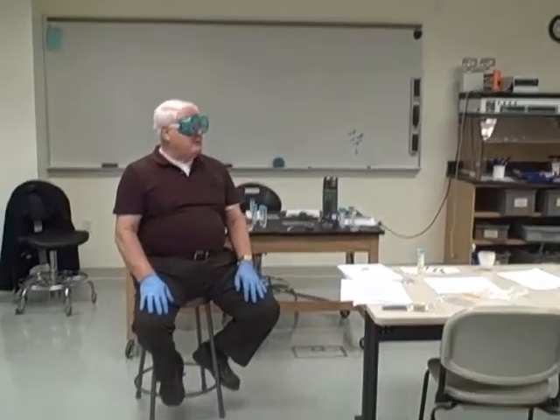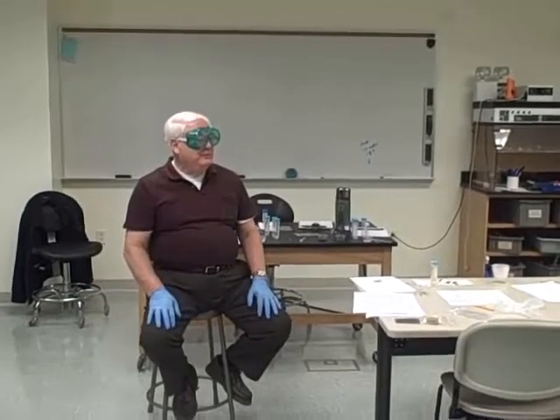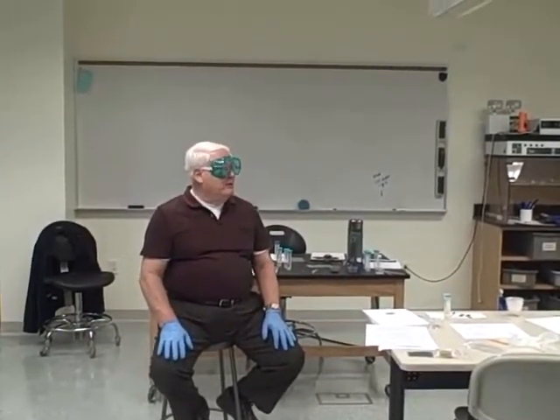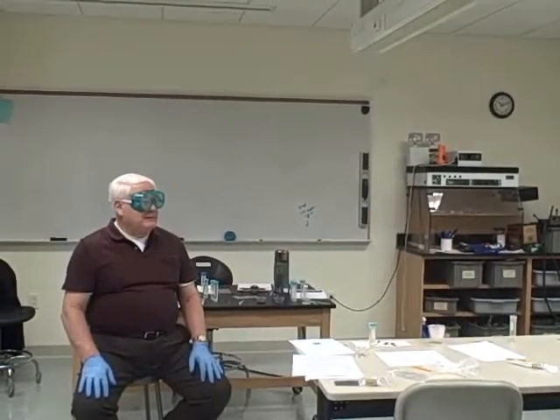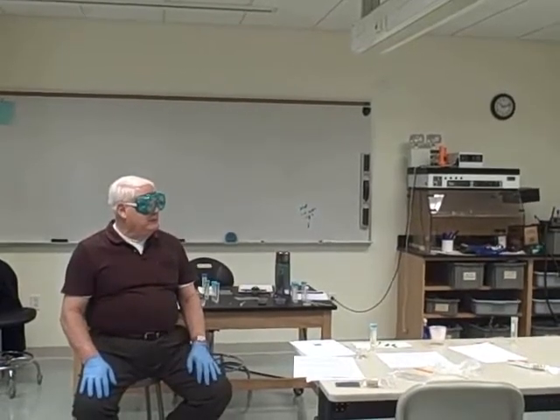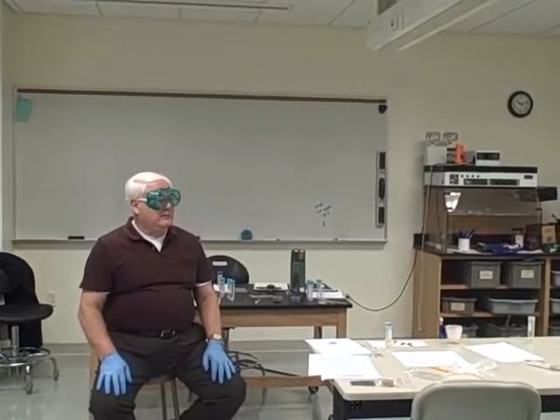Anything happened with that experiment? I got copper. Yeah, the copper came out of solution, which indicates that the aluminum is the most reactive and the copper is least reactive, and it reverted back to its elemental form. Okay? So that shows a little bit of how reactivity of metals can give an indication of where we expect metals to be found in nature.